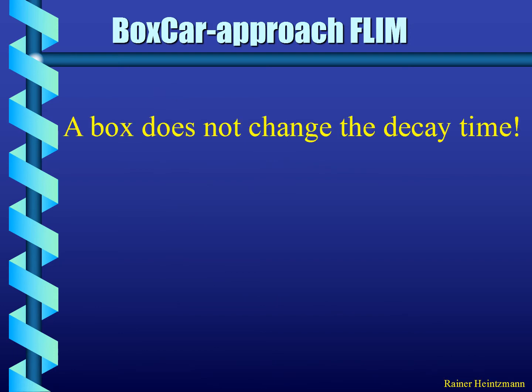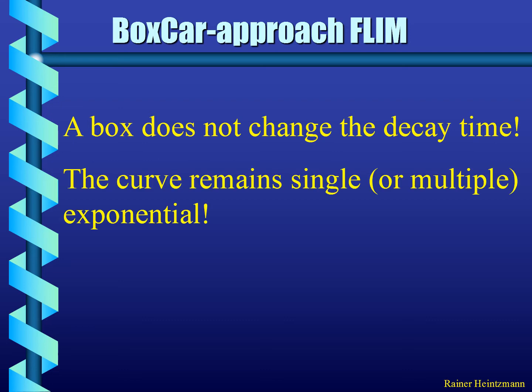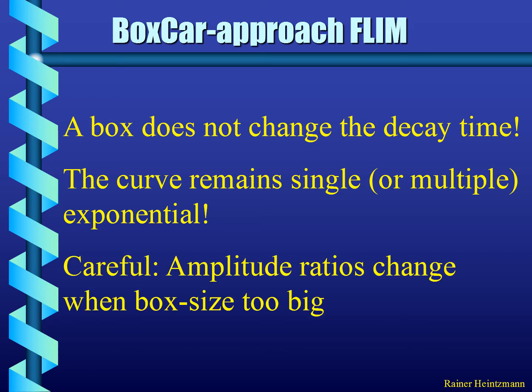So, as I said, a box does not change the decay time, and that also means the curve remains single exponential if you're starting with a single exponential curve. And of course, you have to be careful with the start of the curve when you're integrating this. But if you start your fit late enough, or if you make sure that the box starts only after the full excitation, after the excitation pulse has finished, then you should be fine. What you have to be careful with is the amplitude ratios.